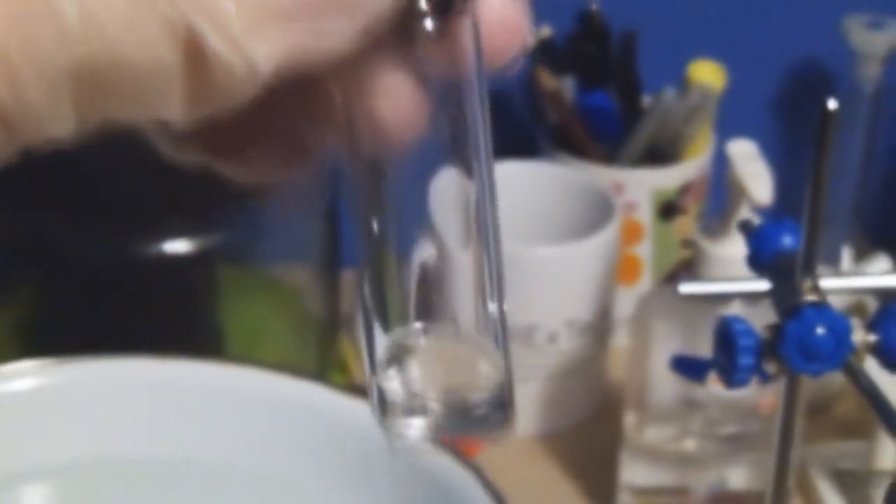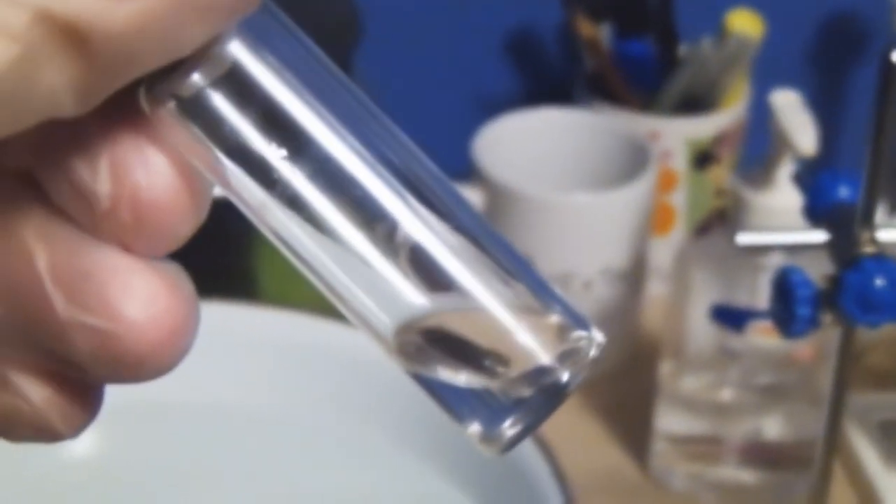This limonene oil we've extracted contains 90% limonene compound, along with the other 10% being other terpenes and flavonoids. Getting an even higher purity of 99% or above would require a technique called chromatography, which I will not be demonstrating in this video.